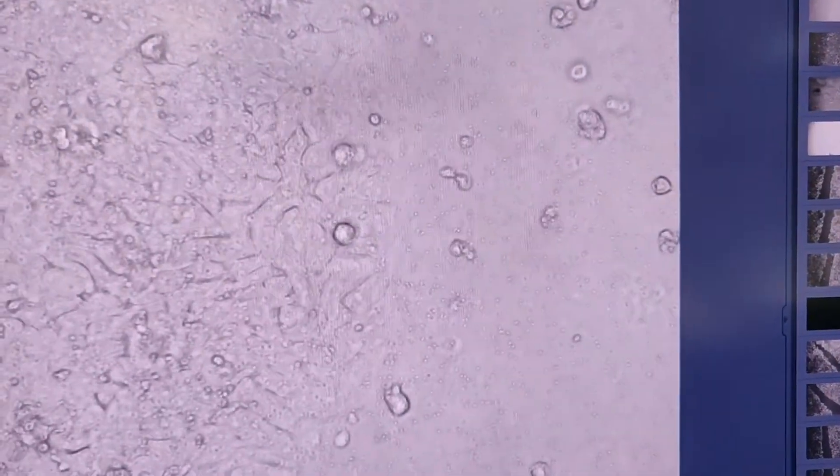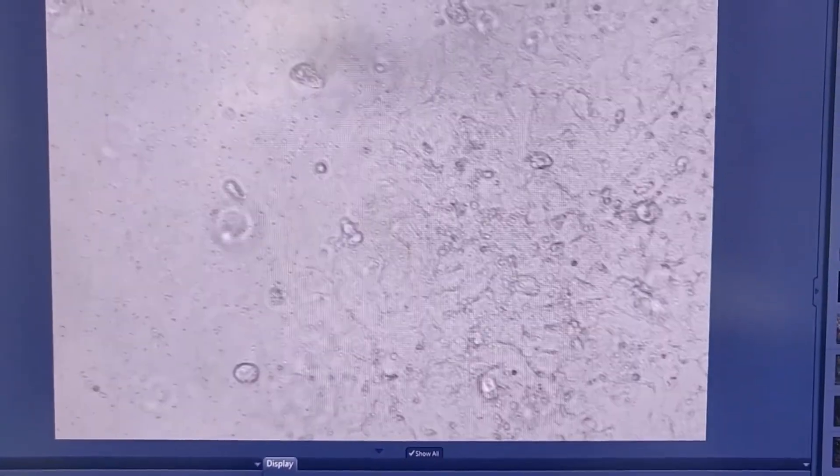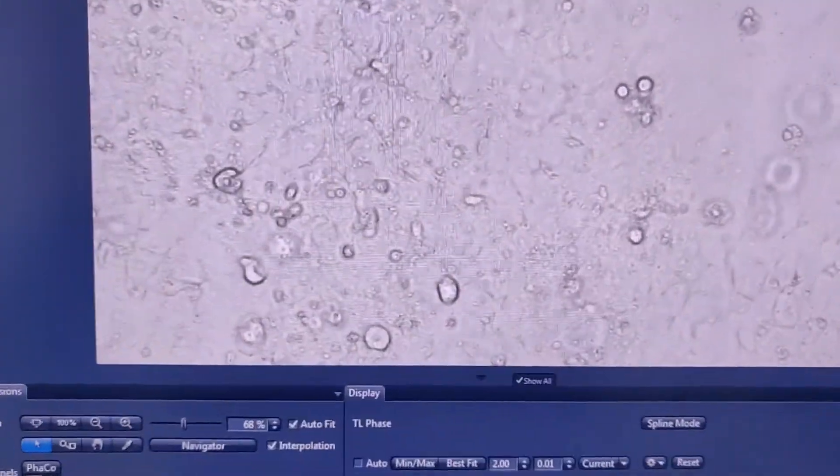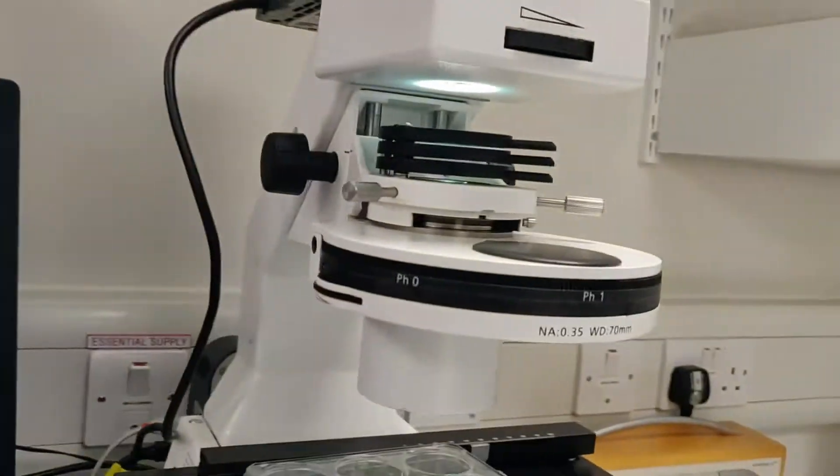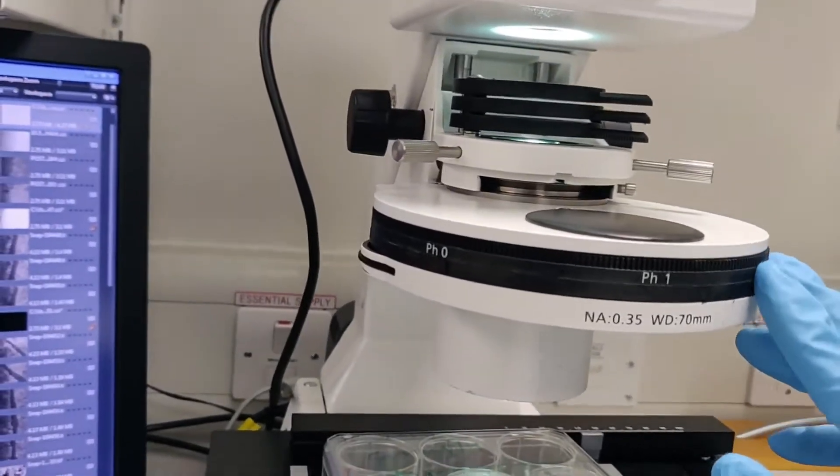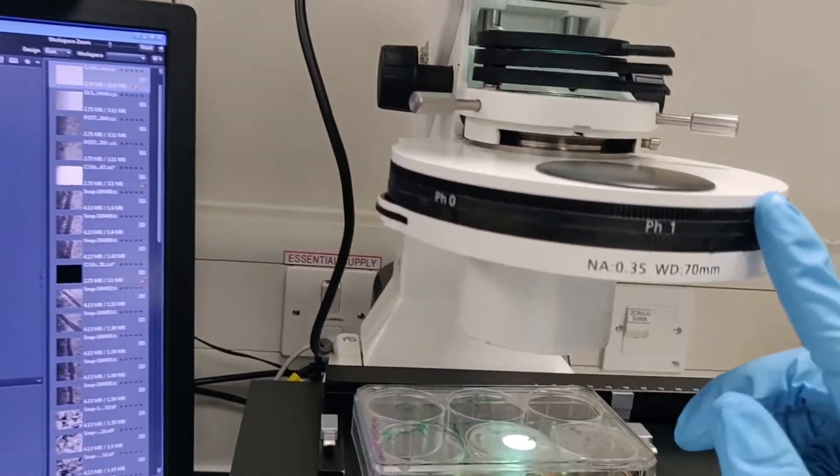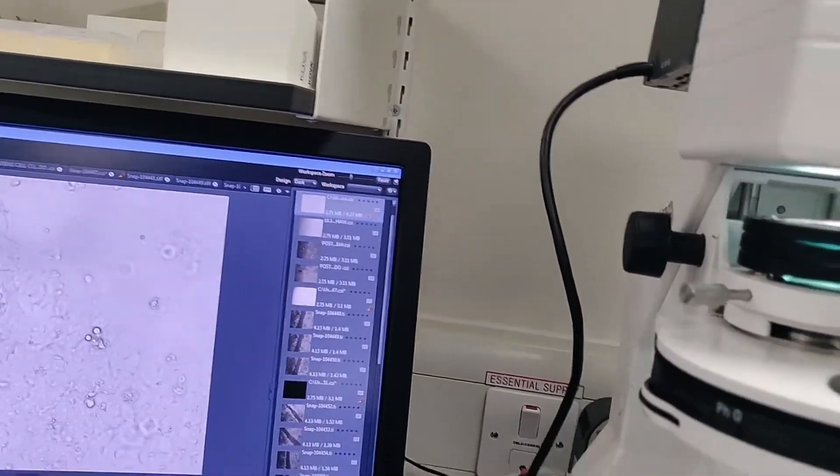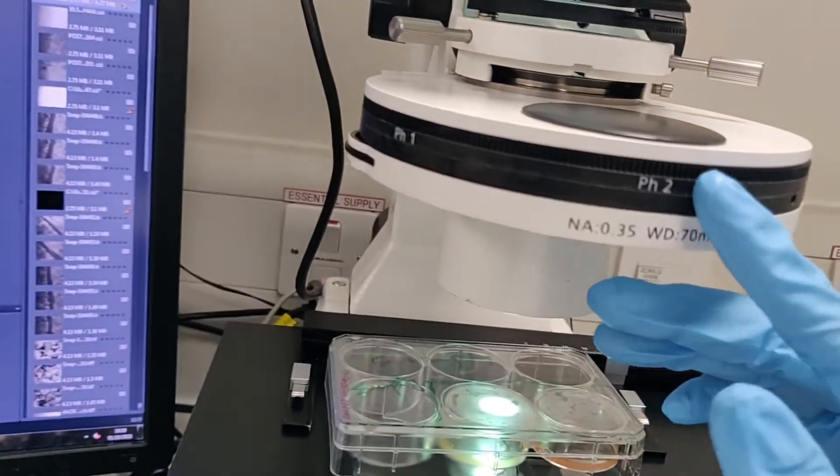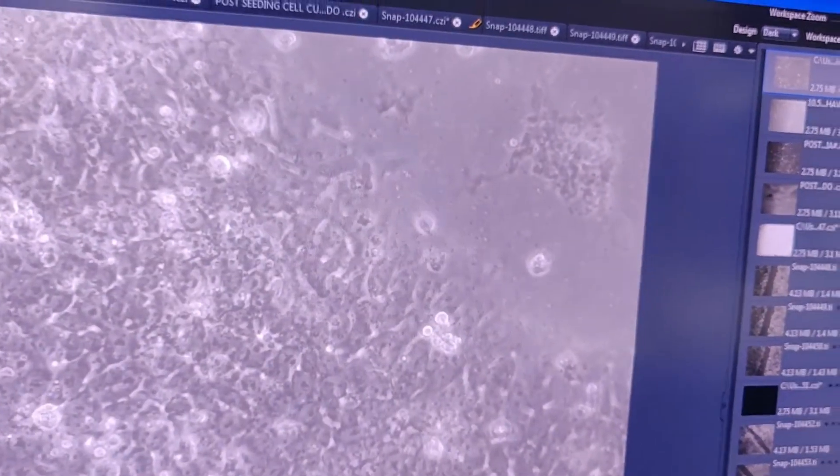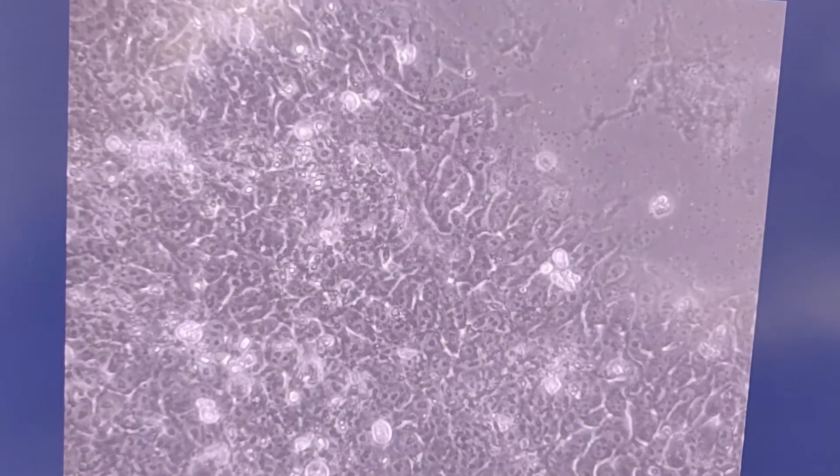Now, I will go to 20x. Adjust a little bit. Yeah. And right. So, in this phase, you can see the dots are moving. But we can make it much better by just playing with the lights. So, this is phase contrast microscope and I can manage how much light can basically go through the object. So, now I put on phase 2. Just a little bit of adjustment. You can see, you can even see the cells with their nucleus.